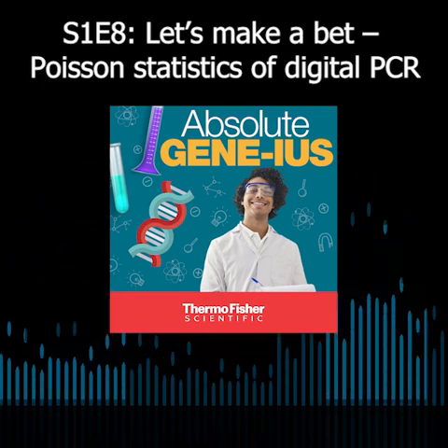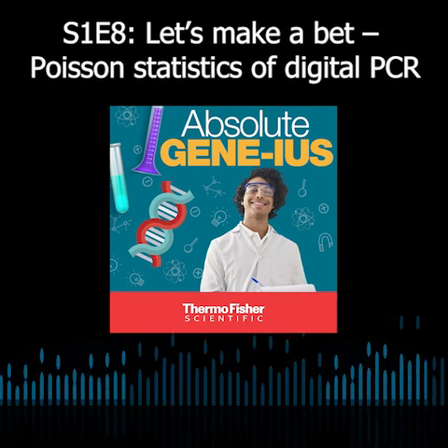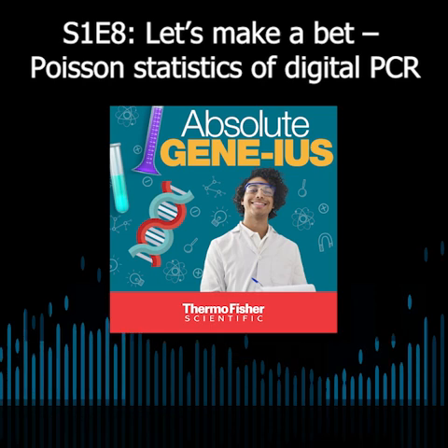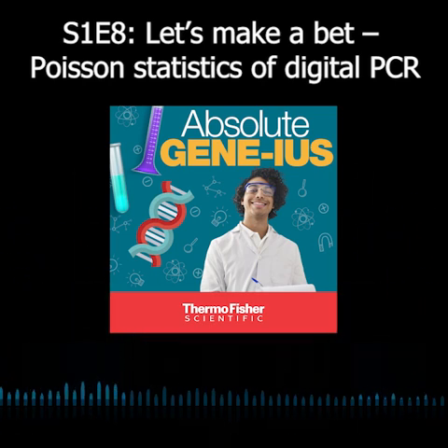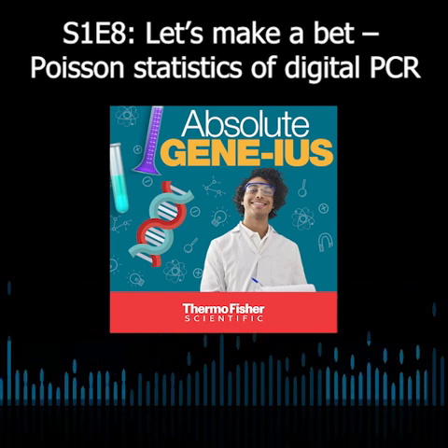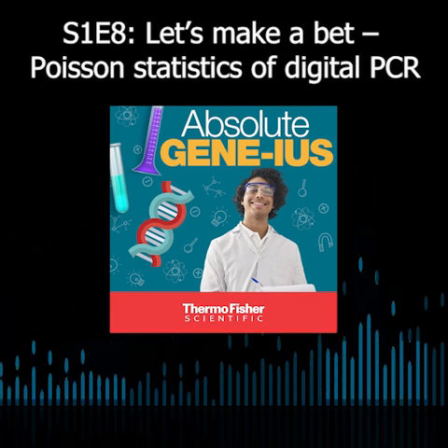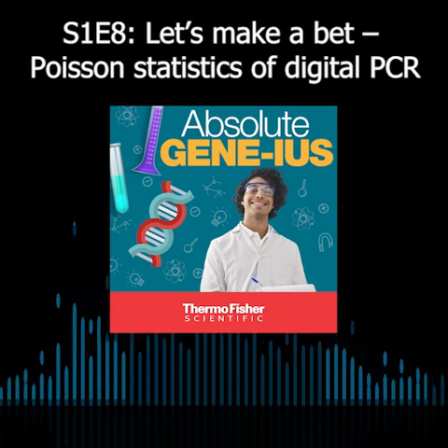If I had a really small number of microchambers, I might say that I have 100 copies per microliter, but my range of uncertainty might be 10. So I'm saying something like 100 plus or minus 10. But if I had more and more microchambers, I could make that confidence in concentration get better and better. So instead of 100 plus or minus 10, now I might be saying 100 plus or minus 2. There's no limit on how small you can make that uncertainty as the number of chambers grows. Well, that's awesome.